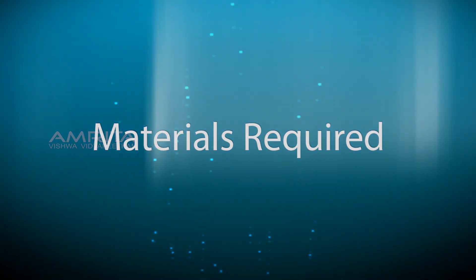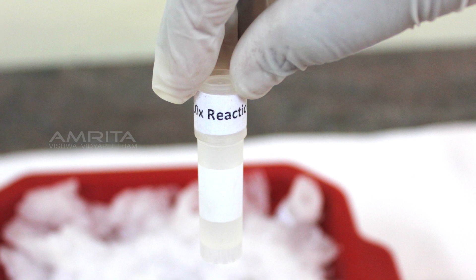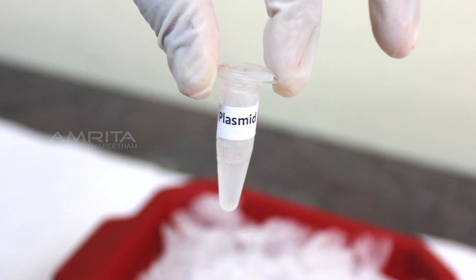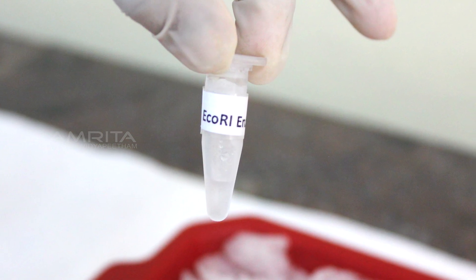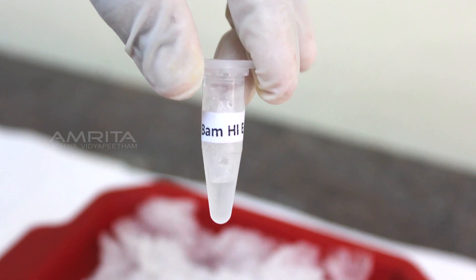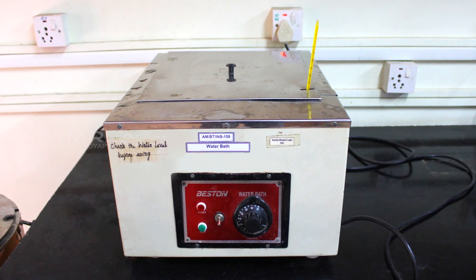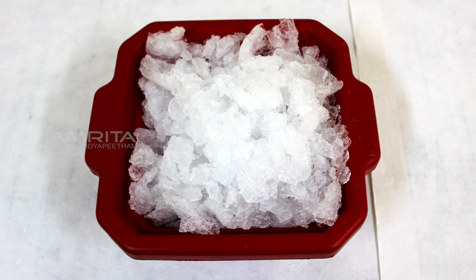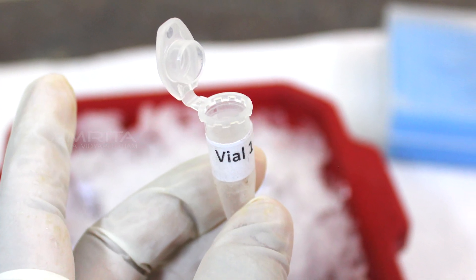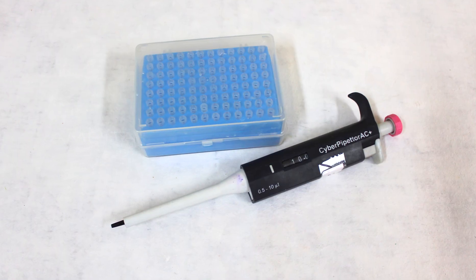Materials required: 5 microliters of deionized water, 1 microlitre of 10x reaction buffer, 3 microliters of plasmid DNA, 0.5 microliters of EcoR1 enzyme, 0.5 microliters of BamH1 enzyme, centrifuge, water bath, ice box, floater, empty vial labeled vial 1, waste beaker, pipette and tip box.